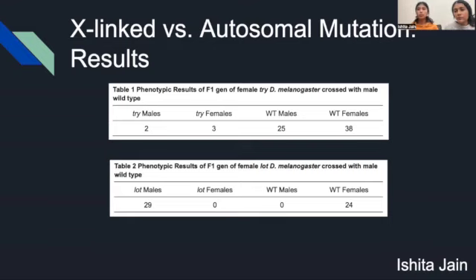What this would result in is perhaps there was a male fly that became sexually mature and impregnated one of the so-called virgin female flies, thus messing with the results a little bit. In the second table, you can see that the lot mutation has an X-linked mode of inheritance, and this is because all of the males were mutated and all of the females were wild type.